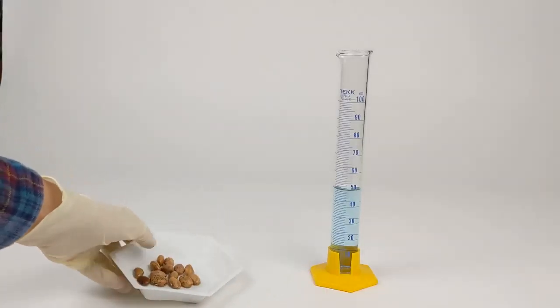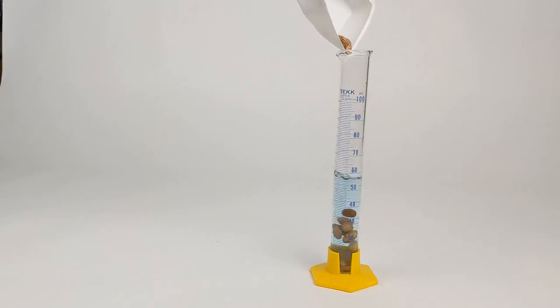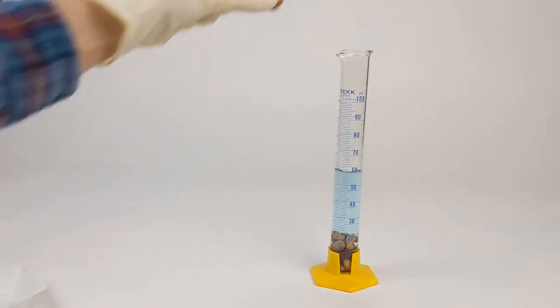Now that we've counted out 15 beans, we need to determine their volume. We're doing this by displacement in 50 milliliters of water. Oops, one escaped. Get back in there.